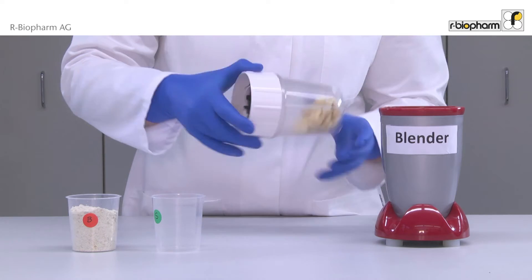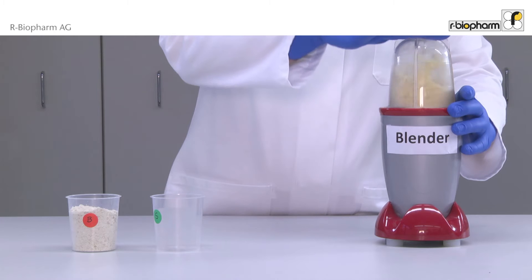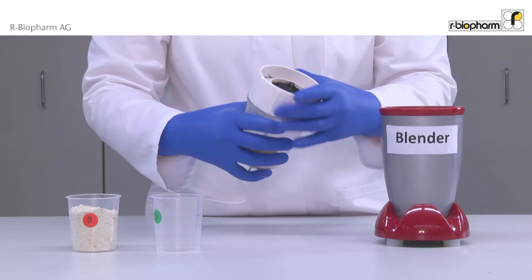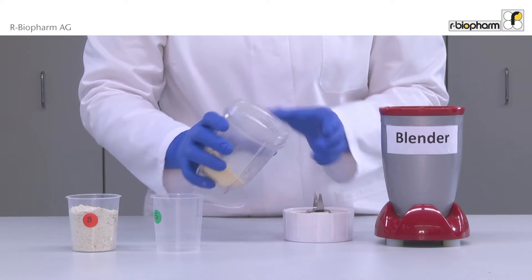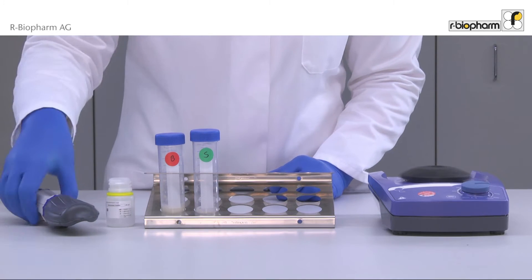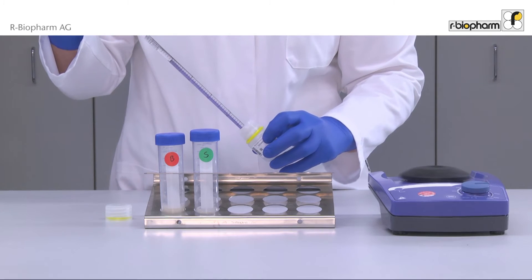The sample is homogenized using a blender. Then weigh in exactly 1g of homogenized sample. Add 7.5ml of extraction buffer to the 1g sample.